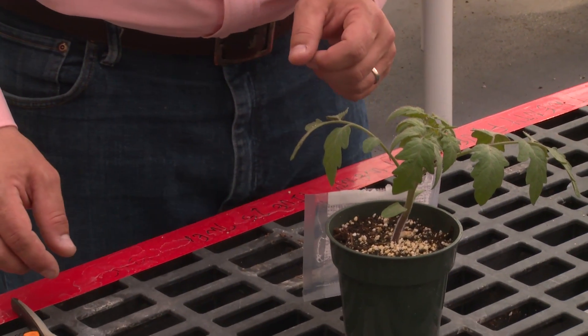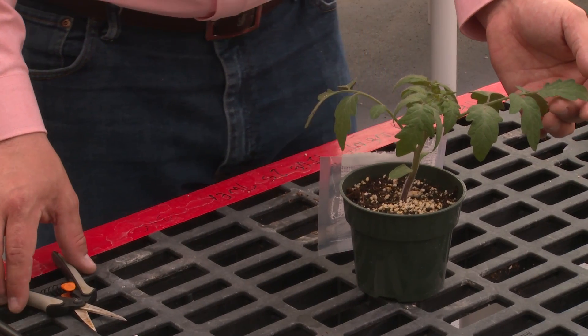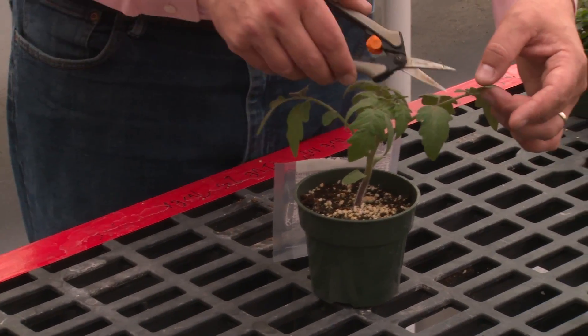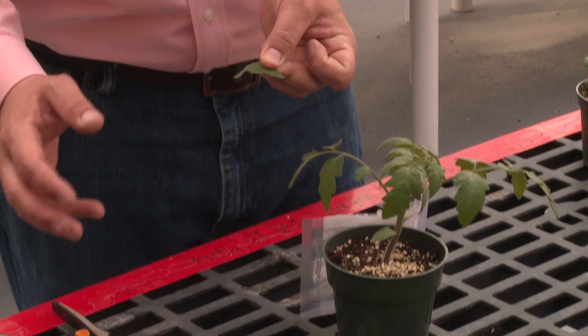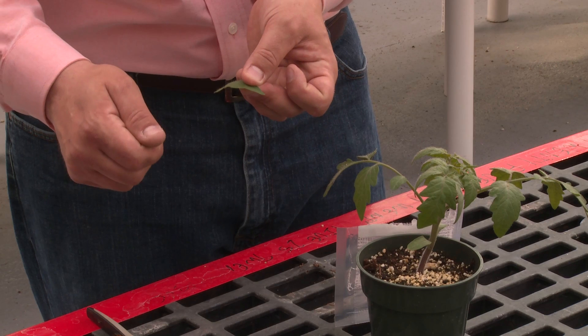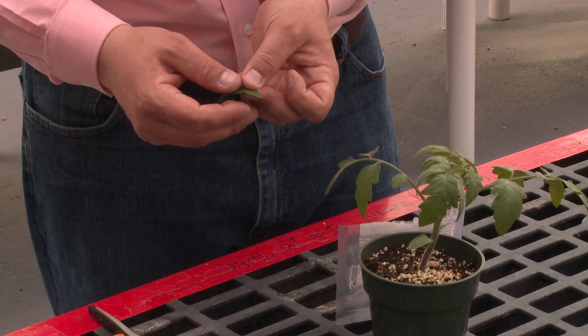Next we want to get approximately one square inch of tissue from the plants that we're testing. With this tomato I'm simply going to cut off a leaflet — that's close to about a square inch. For very thick leaves you may need to use slightly less tissue, as we're trying to achieve a dilution rate of approximately 1 to 20 plant tissue to buffer.